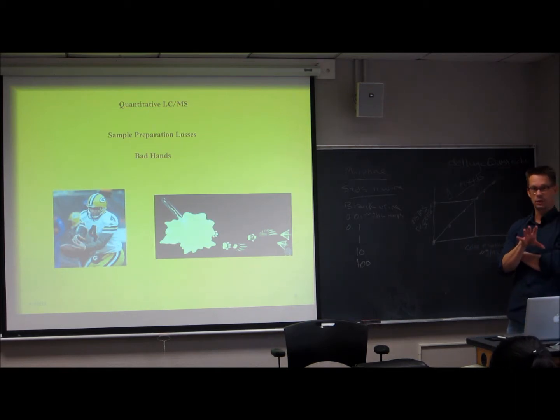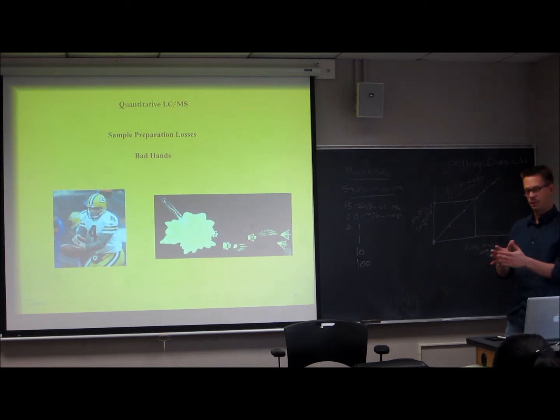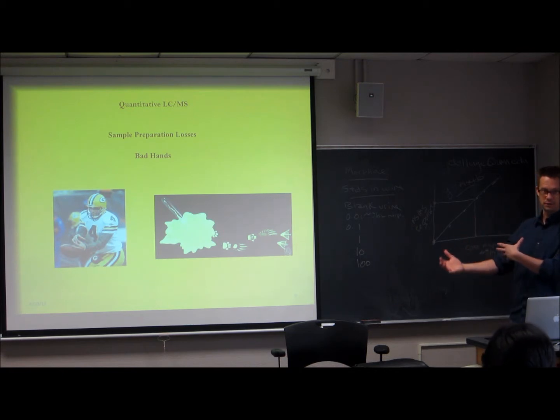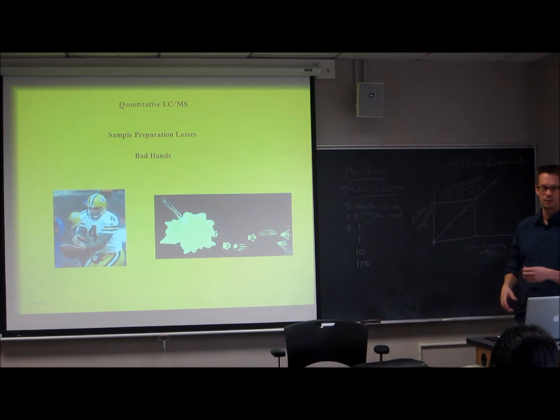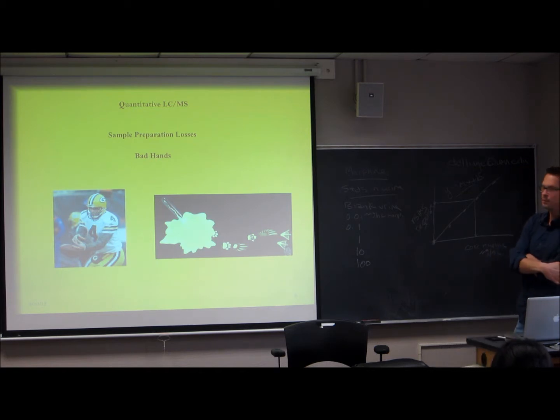Especially where you're talking about doing extractions and sample pre-purification from solids. If you're talking about concentration in urine and you have a 2 mL urine sample and you spill a little on the floor, that concentration is going to be the same in what's left. But if you've carefully measured out milligram quantities of a solid, and then you do your first hexane extraction, you get a liquid, and one of them tips over in the lab. Now we don't have the same mass of the compound you're quantifying in the tube as we used to have. So you can get sample preparation losses right at the bench.